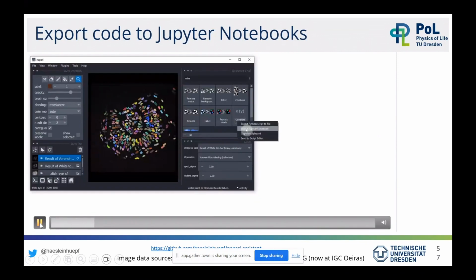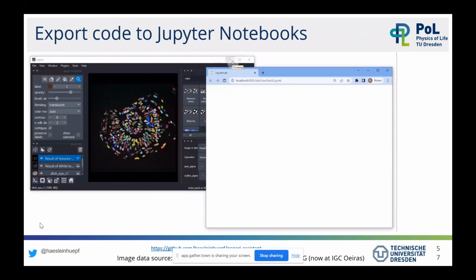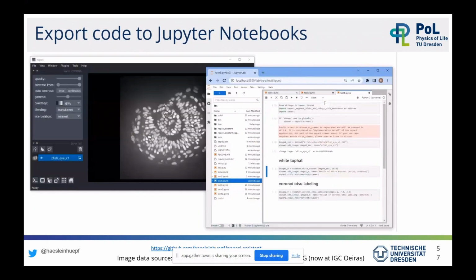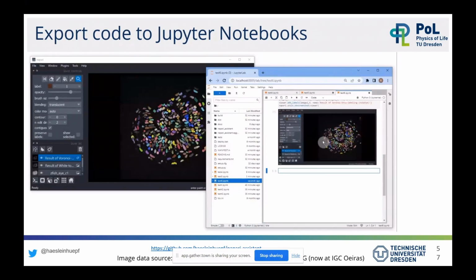So you see here, I generate a notebook which shows some Python code. You see here 5 cells of Python code, and I'm executing them. And there's a Napari viewer opening on the left, showing the same segmentation result as we've seen before. I think I will show it live in action in a minute, so you can all watch how I do that. And there is also a written tutorial on how you can do this step by step on your own.